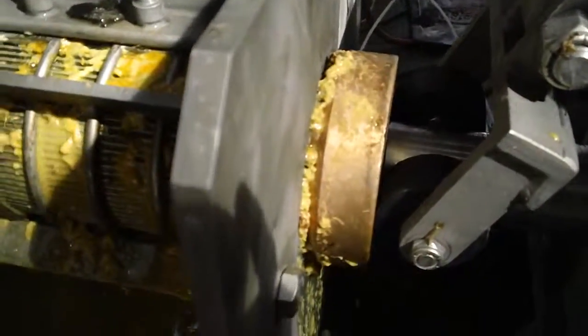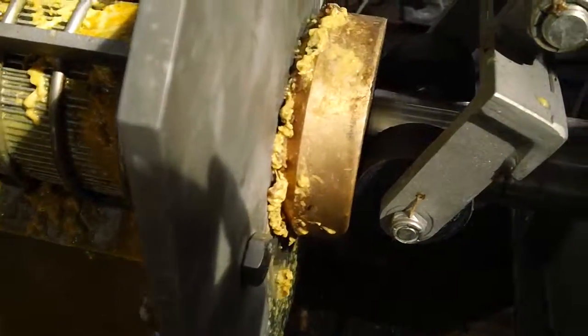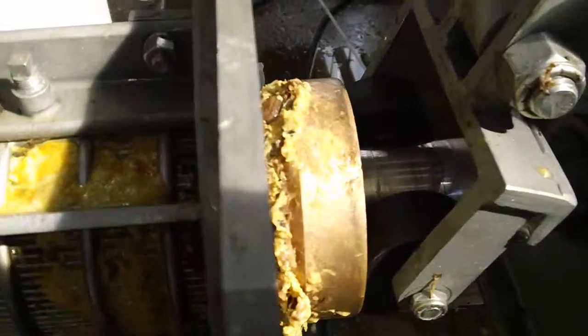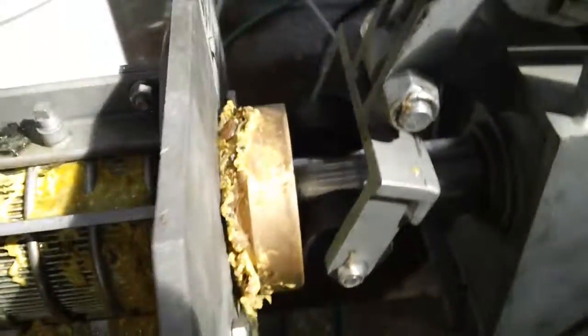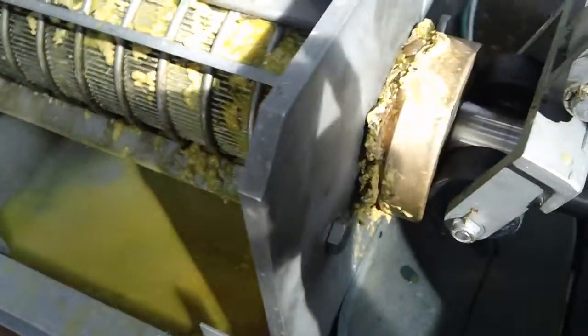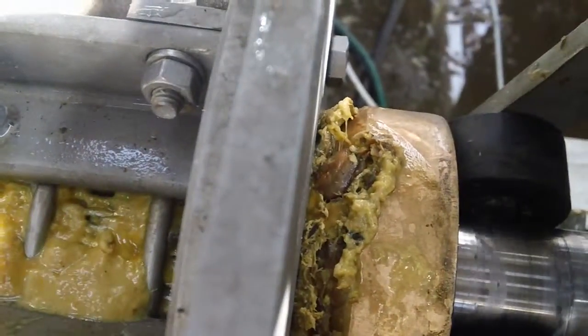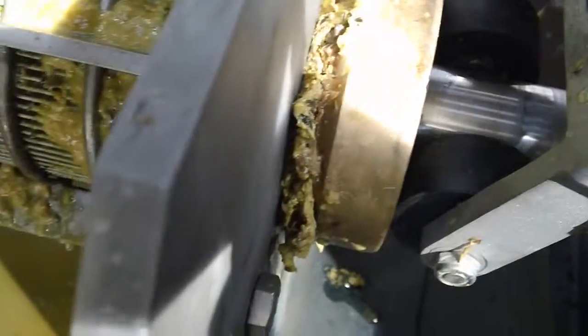There may even be enough cake that we can take a sample. Chase it out. There we go, look at that. Bill, will you hand me that scoop, please? I'm sorry, you only have 2 hands. I'm going to place a scoop under here so that some of the solids will fall into it. There actually is a piece of mushroom from the previous test. So whatever sample I take, I'll want to take towards the end. Bill is putting a chaser in that will push the remaining material out.